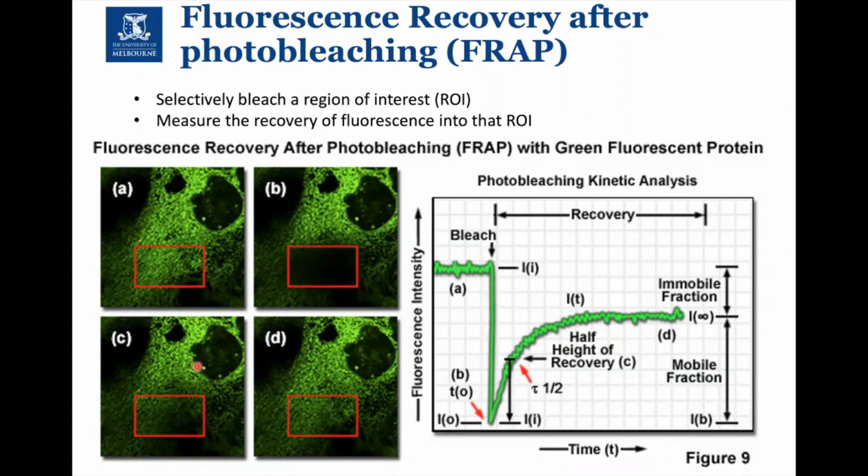And then we follow that over time and we look at the recovery of fluorescence back into that region. And that tends to be mobility of molecules from outside the region into there. And this is the recovery here. And we can quantify that and look at the T-half for the recovery, how much recovered, how much didn't recover, and that gives us different readouts in terms of the mobility of the molecules.